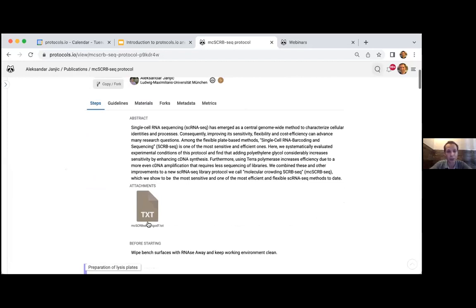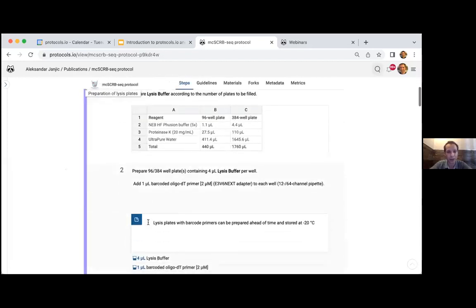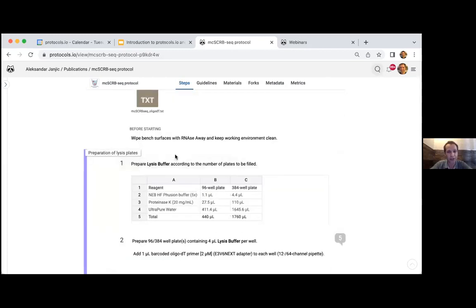As you will notice, they are not just plain text. These are dynamic and interactive. There's a lot of work that has gone in from the Protocols.io side into adding support for really reporting reproducible methods. So we have components and structure inside the editor if you're playing around with it.